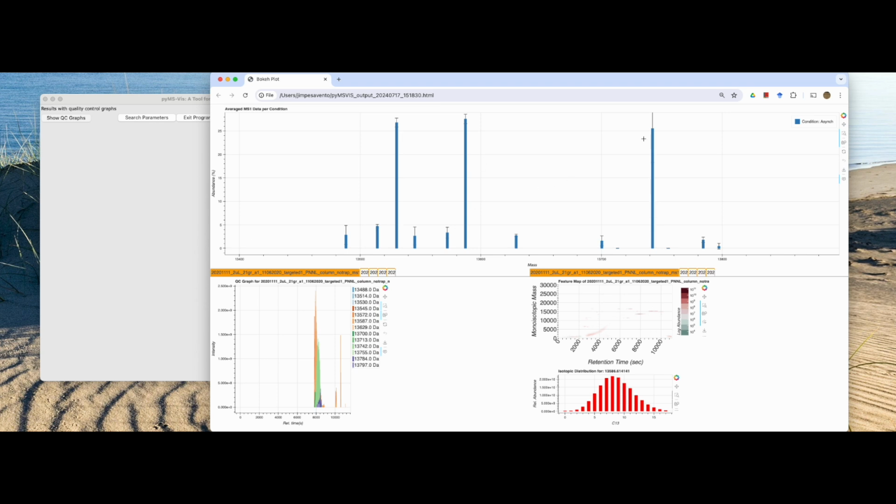Error bars look relatively good for LCMS data from histones that were extracted from algae on different days, different conditions, asynchronously grown.